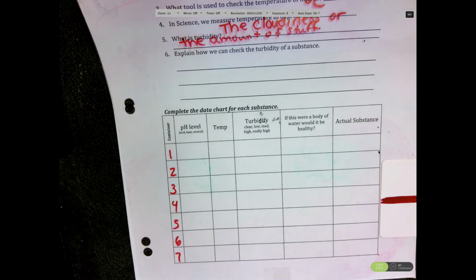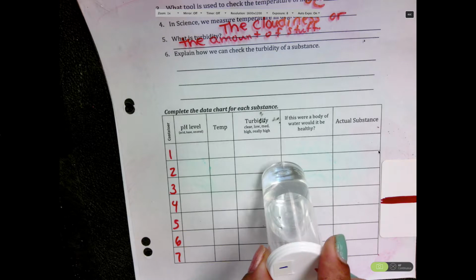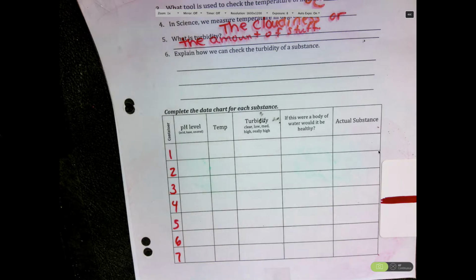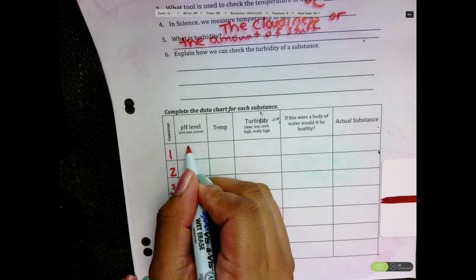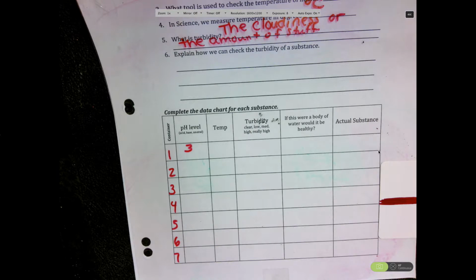All right, so let's start off with our first substance. Our first substance looks like this. Our pH level for this substance is a 3. Would that be acid, base, or neutral? Acid.